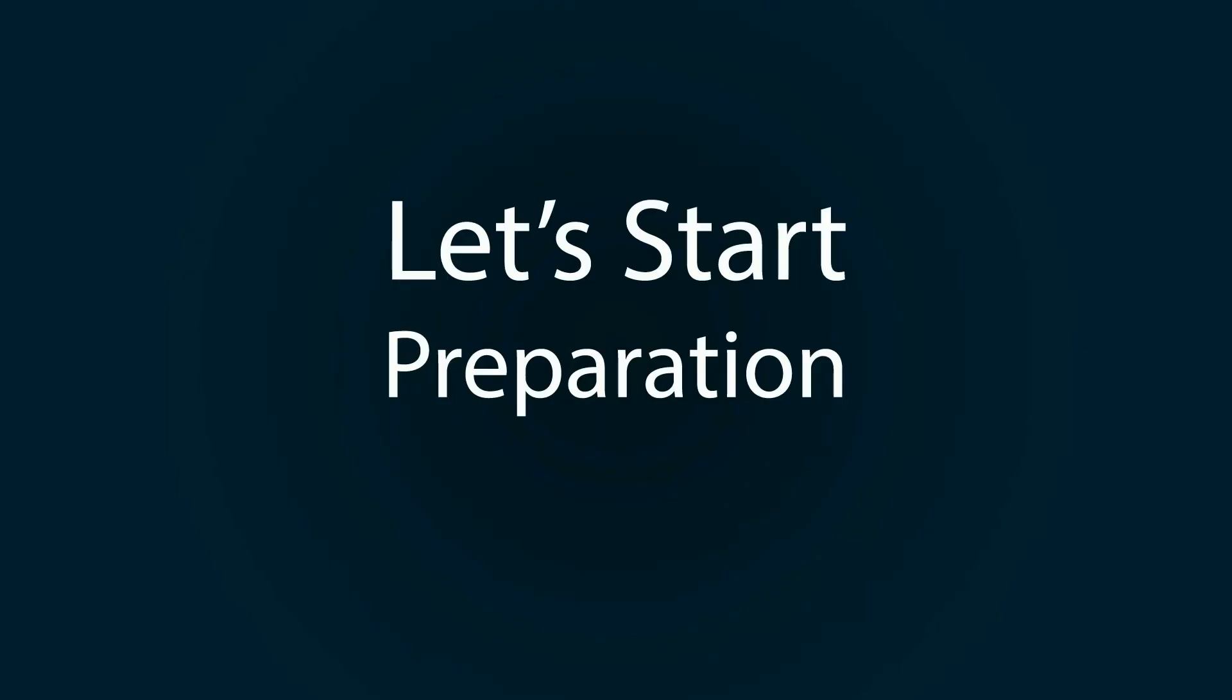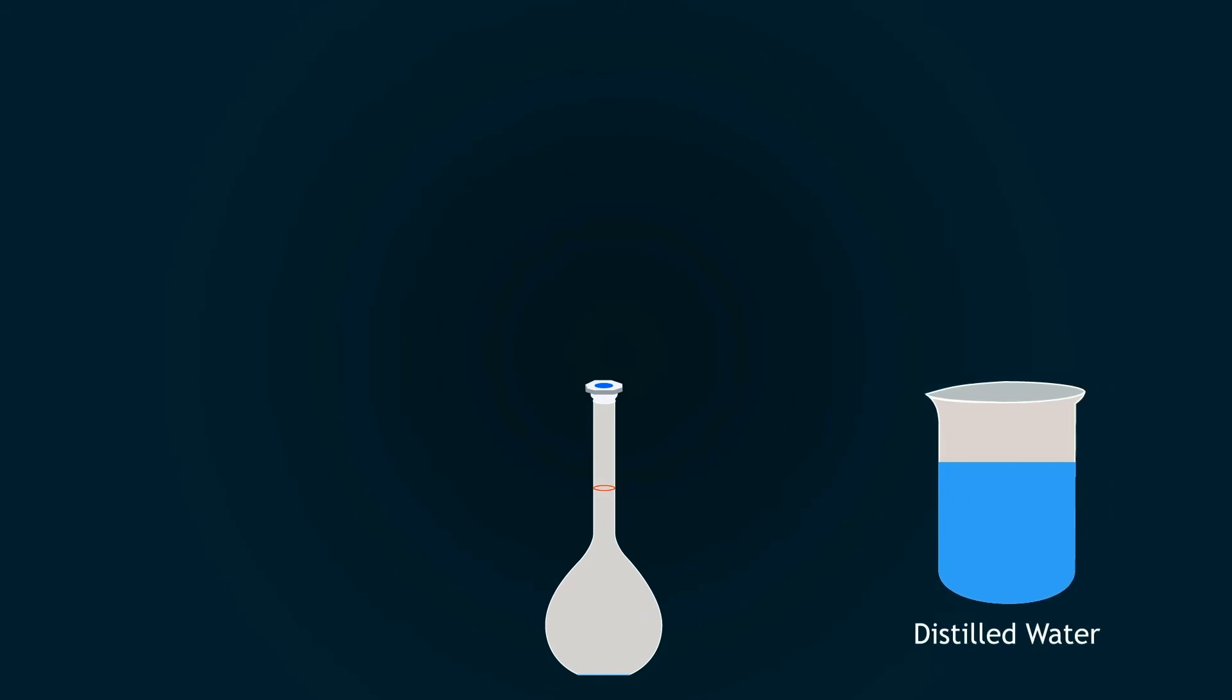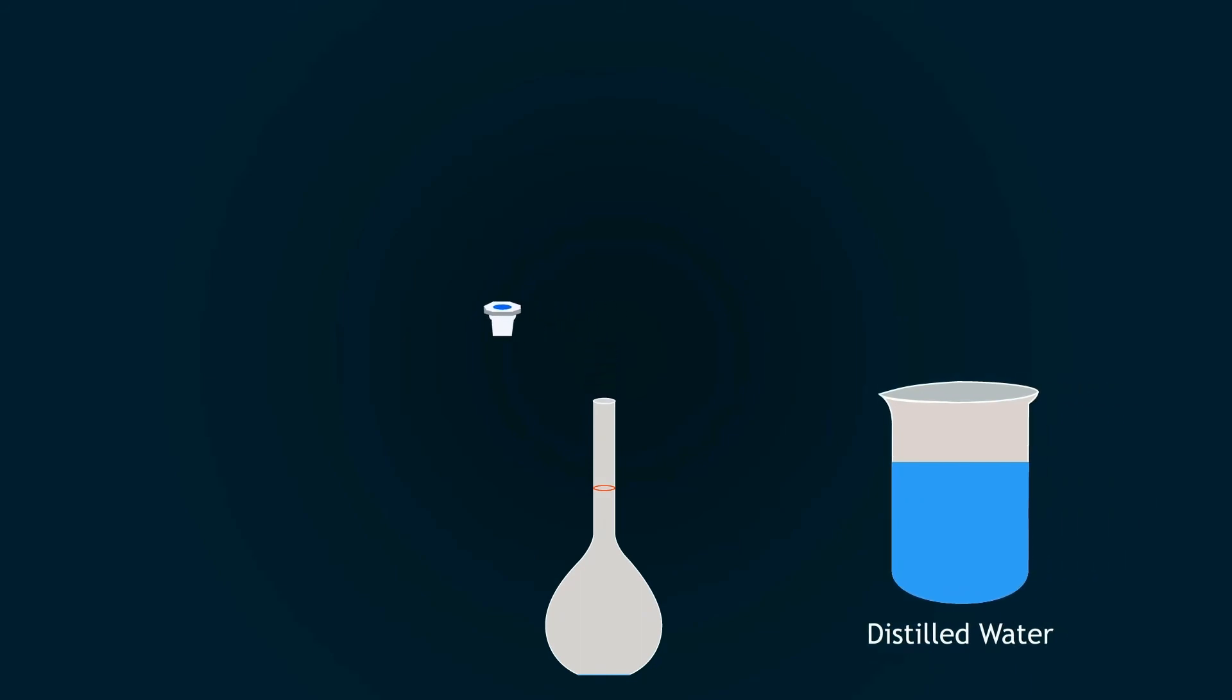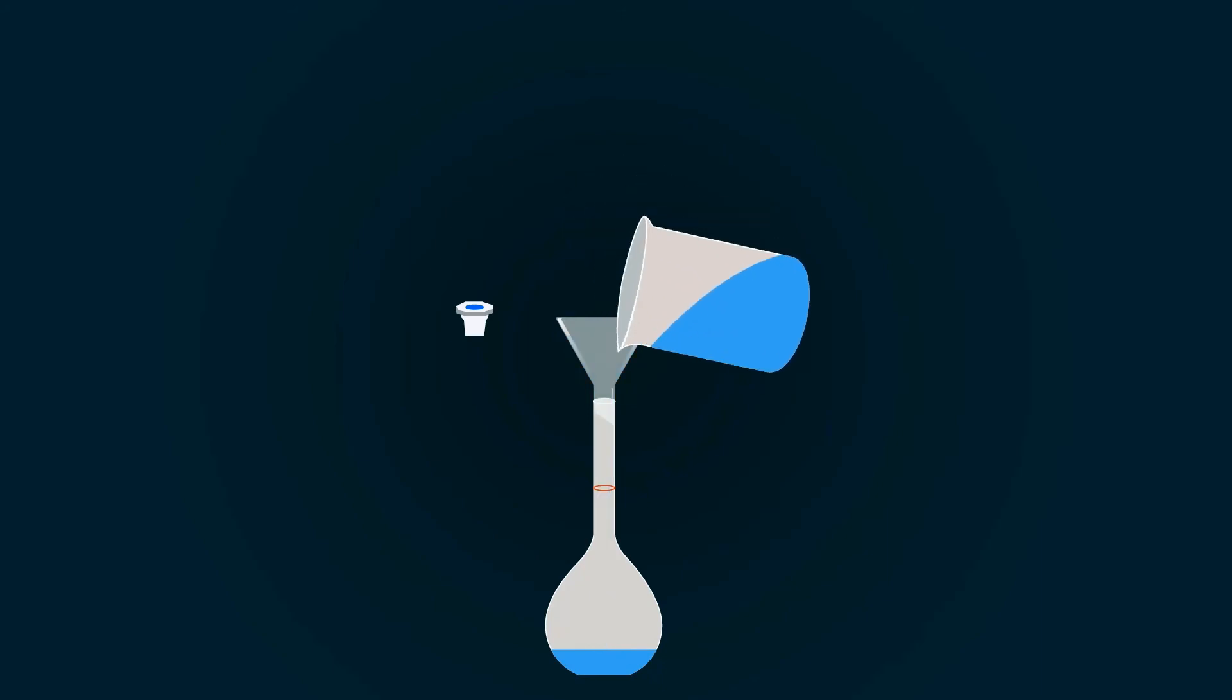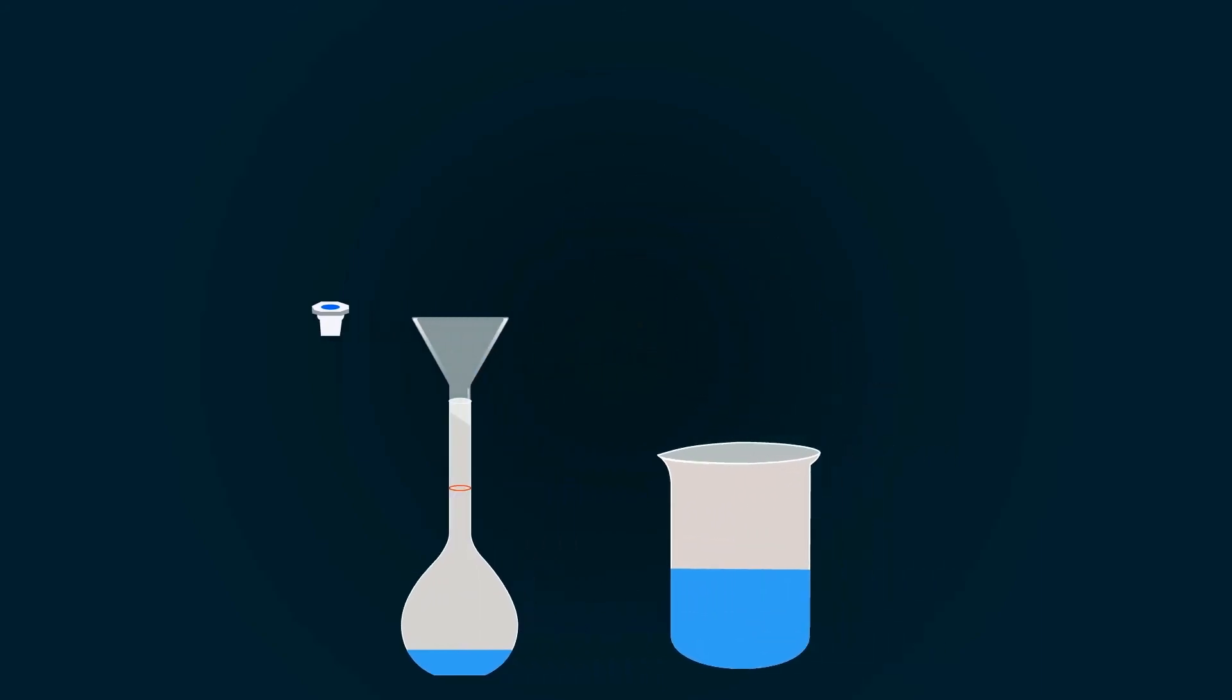Let's start our preparation. First of all, you will take a measuring flask and add some distilled water into this flask with the help of a funnel. Please add some distilled water into the measuring flask while using concentrated acids, because otherwise you may harm yourself and may break your flask.